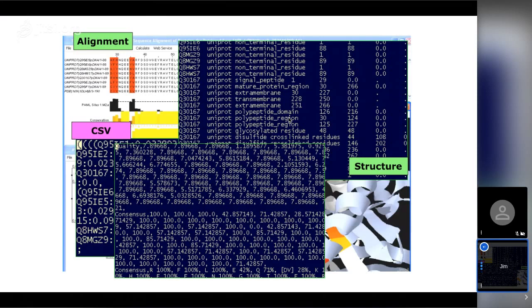CSV — Jalview can export CSVs, and the CSV is here for this histogram. One of the things you might need to do is take data from a web page or take data from a program that's done some calculations about sequences and other kinds of biological information. CSV is one of the simplest formats to export as, and you can import that into Excel or R.